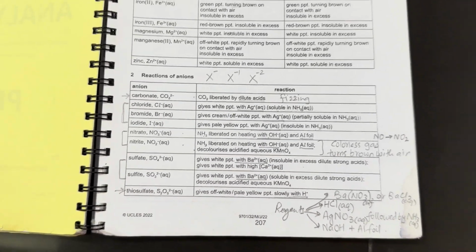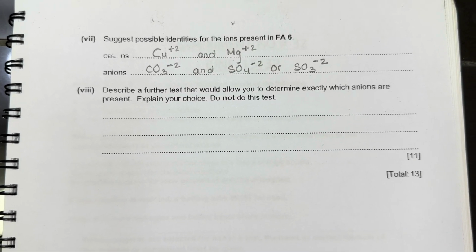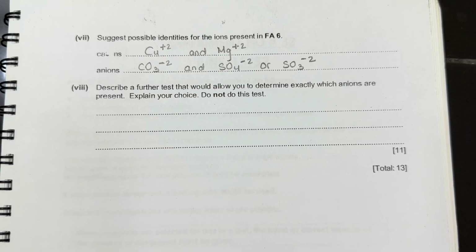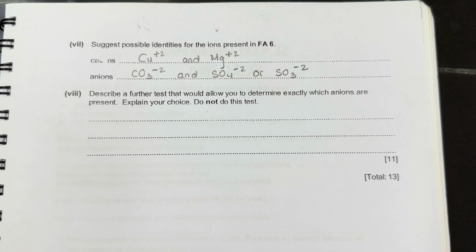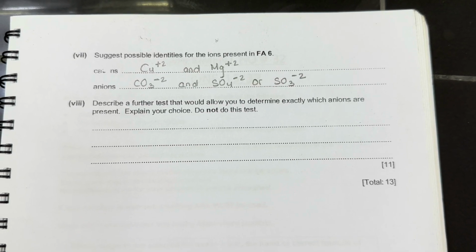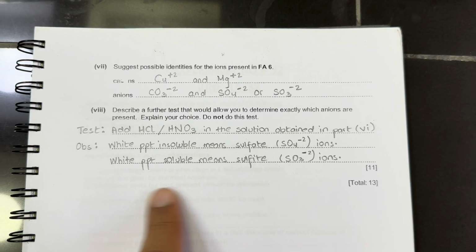We do not have to perform this test, therefore we're not performing, but we will just write this test here that add further hydrochloric acid. We cannot add sulfuric acid because it contains sulfate. So please do not add sulfuric acid here. Only acid we can use here could be hydrochloric acid or nitric acid, because if we add sulfuric acid, it contains sulfate ions already. So we have added this test here, which must not be performed.